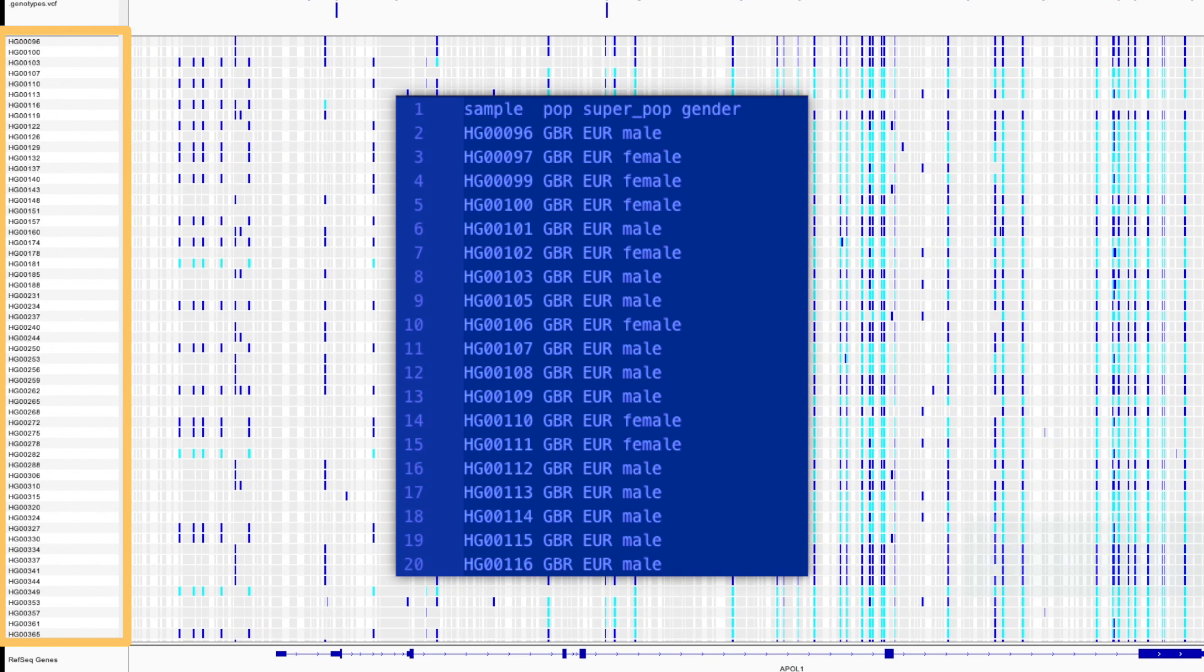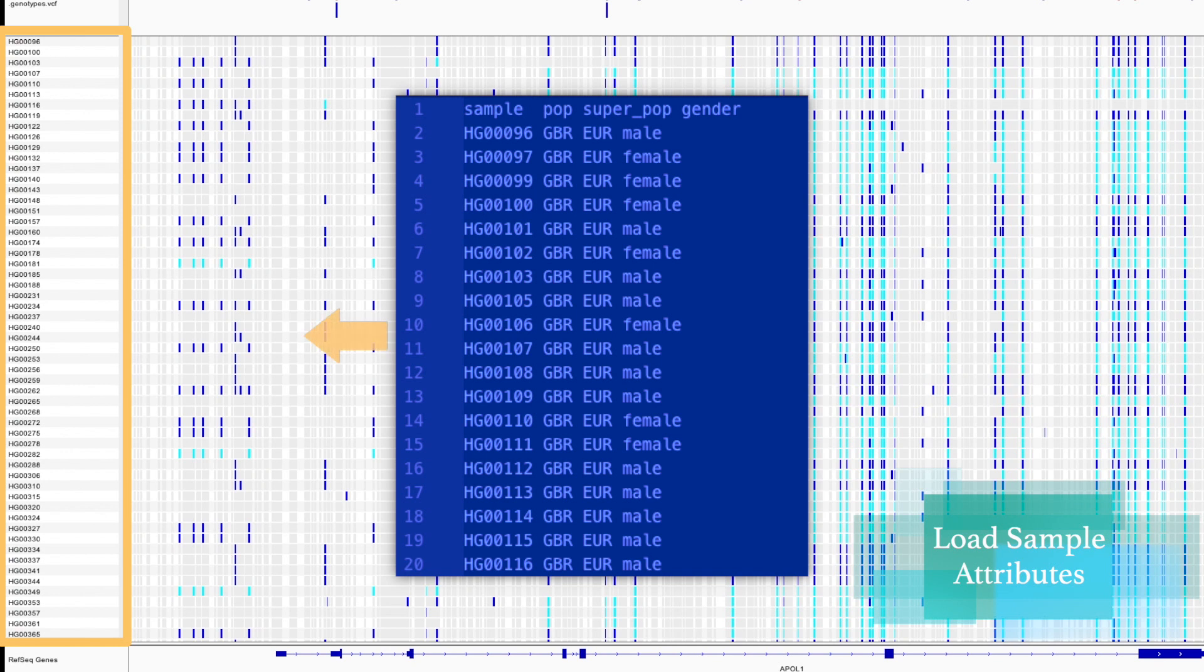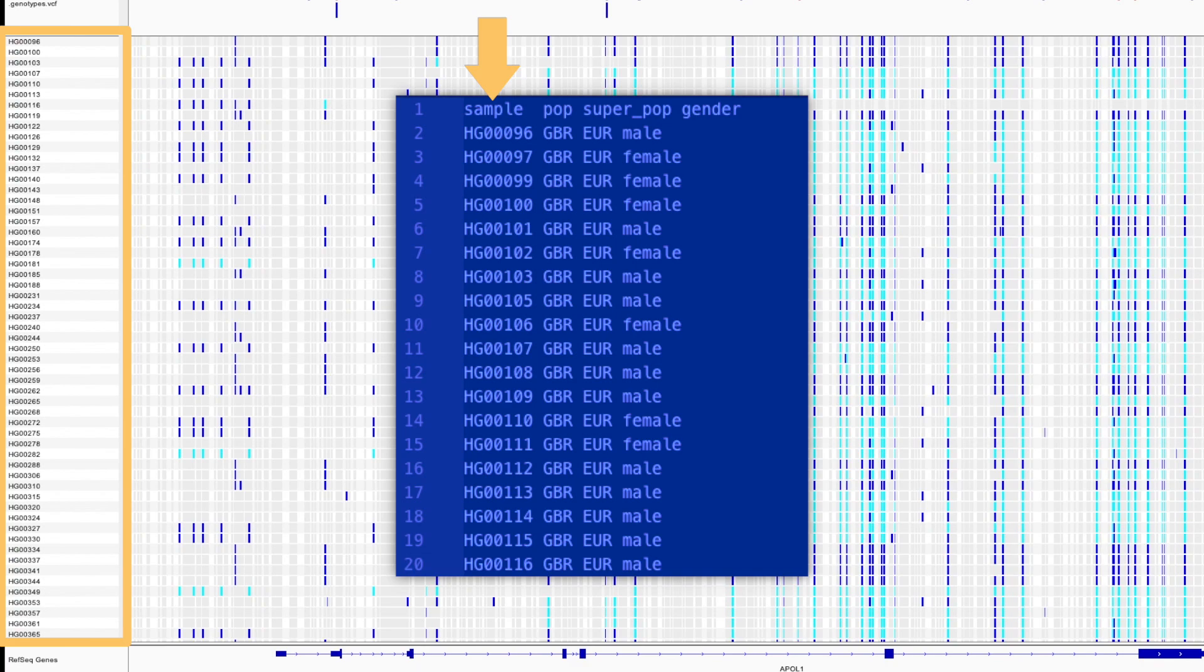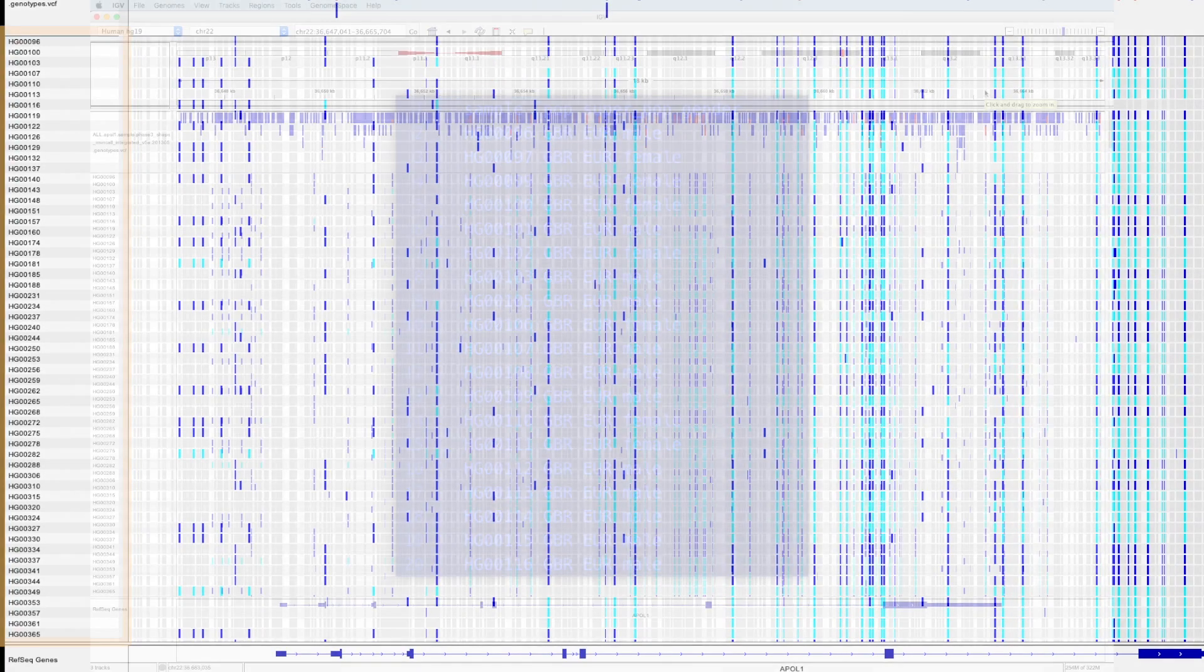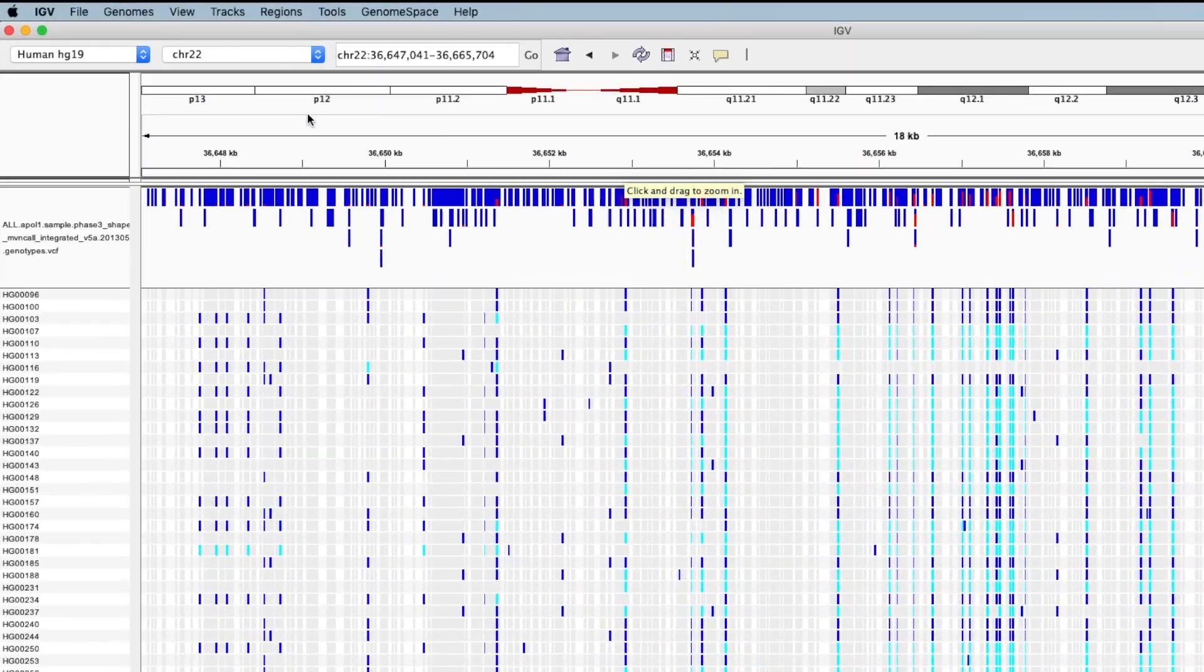Well, IGV has this great feature where if the user loads a text file with information corresponding to preloaded samples, the information will appear as annotations next to the samples. Note that this file needs to be a tab-delimited text file with matching sample names in the first column. So let's try it out.